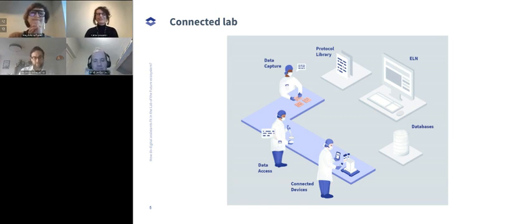And I see that the benefit you could get from a digital assistant is that some of that could be brought back, so you could have that friendly voice on your shoulder, helping you understand the environment of the laboratory you're working in, helping bring you up to speed more quickly if you're a new scientist, and just generally stepping into that gap that has been created by perhaps excessive cost cutting.